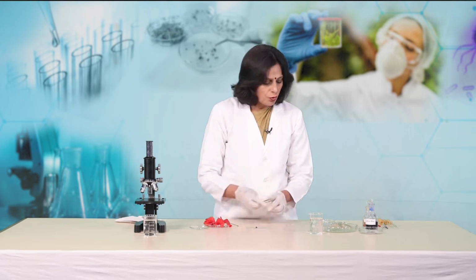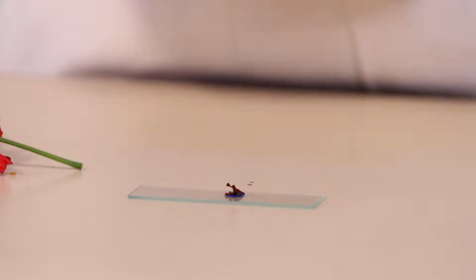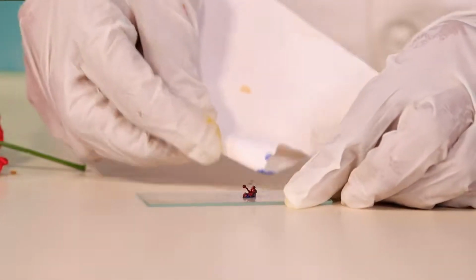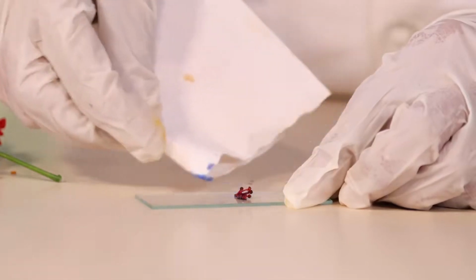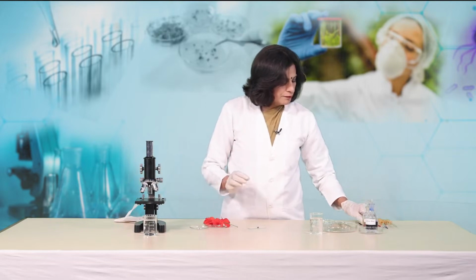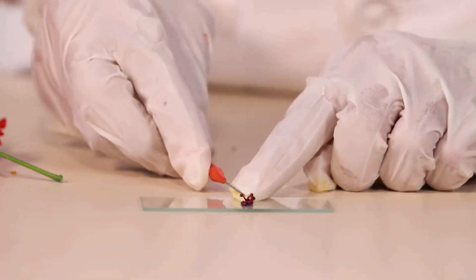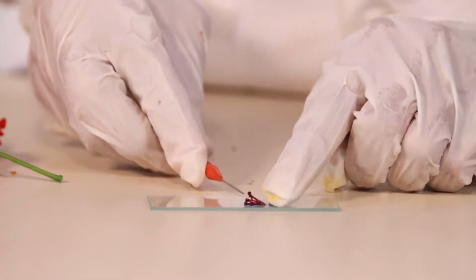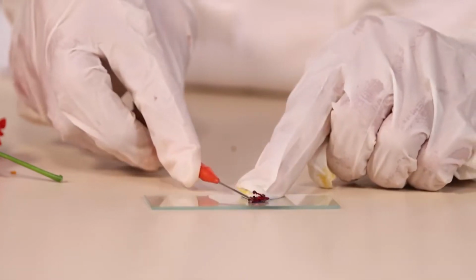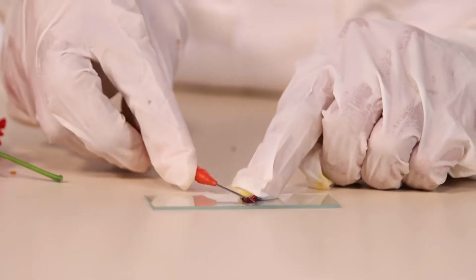Now, we have to remove the excess of stain with the help of the blotting paper, like this, and with the help of this needle we are going to just cut this stigma, because now we have to observe the germinated pollen grain, that is, we will be looking for the pollen tube.